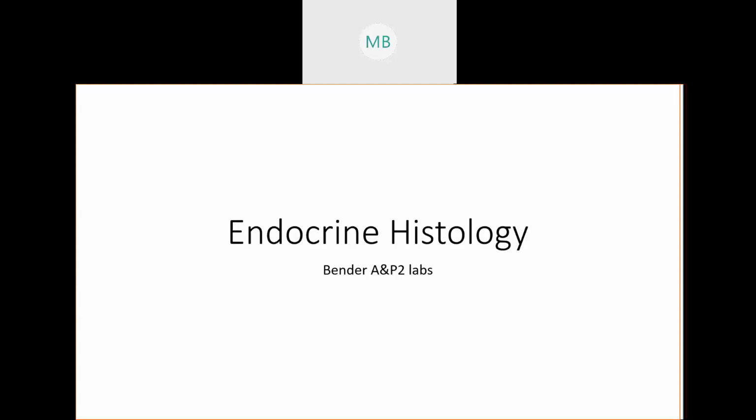Bear in mind, if you are face-to-face, no two people's samples are alike. If you are looking at actual microscope slides, they are legitimately thinly, itty-bitty sliced pieces of somebody else's thyroid gland or pituitary gland or whatever. No two people are alike, so the images will not be identical to the real slides that you are seeing in the classroom if you are in my face-to-face class.